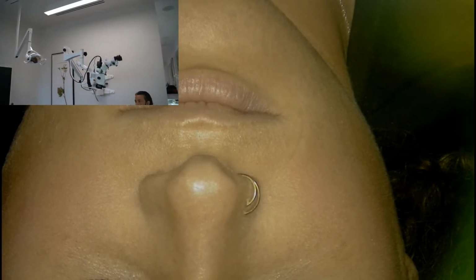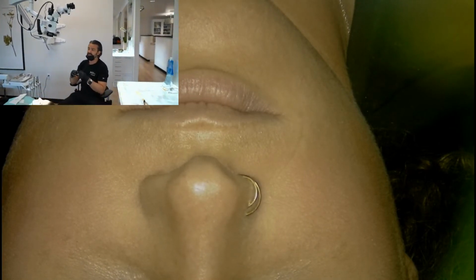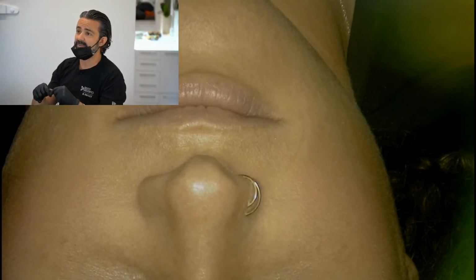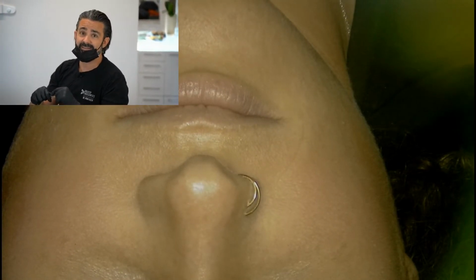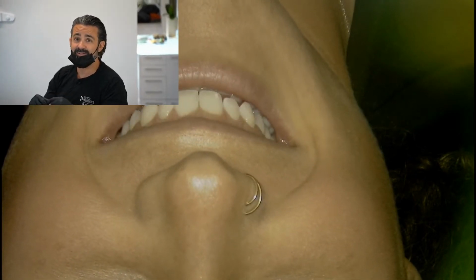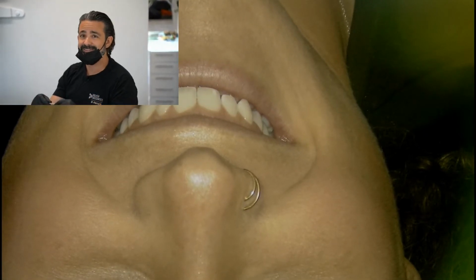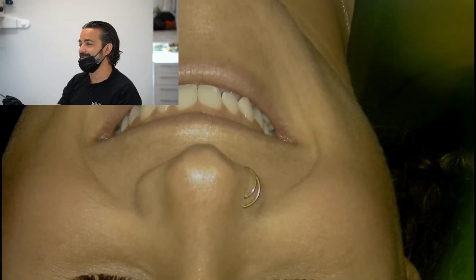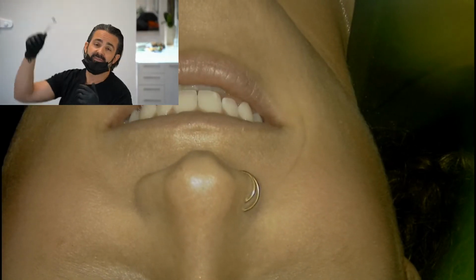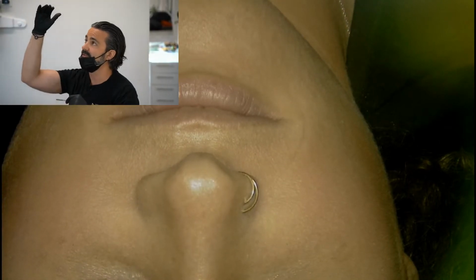And then you have to think about what's upstairs. So like think of this scenario. Think if I was on the bottom floor of this building and I had a bunch of rowdy endodontists upstairs. I mean, those endodontists, they love to jump around the room, right? People are screaming, babies are crying. So the reality is, if there's a lot of walking upstairs, you don't want it to vibrate your microscope if you have a level up above you.